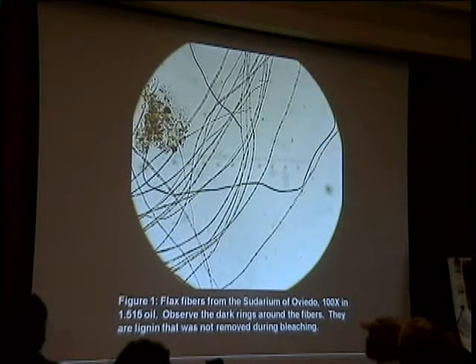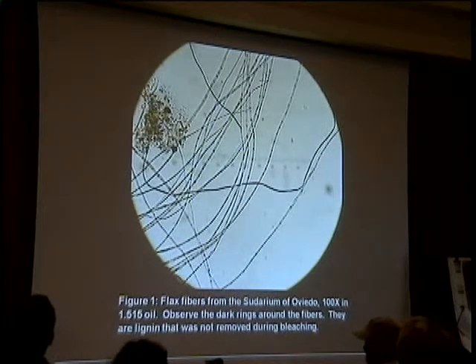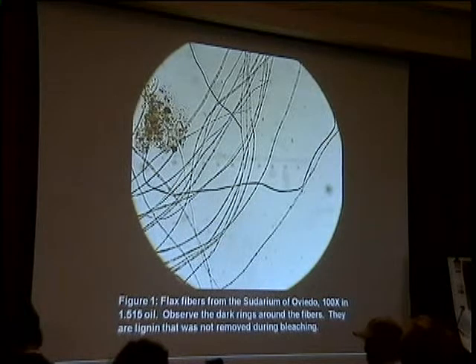Figure 1 shows a photomicrograph of representative fibers from the Sudarium. The fibers are flax. Flax has a characteristic structure that looks like small lengths of bamboo, with straight segments separated by wider growth nodes. These fibers are relatively supple and do not show any significant microbial decay. The color can still be called white, unlike very old linen samples. An important characteristic is the presence of residual deposits of lignin at the growth nodes of the flax fibers.